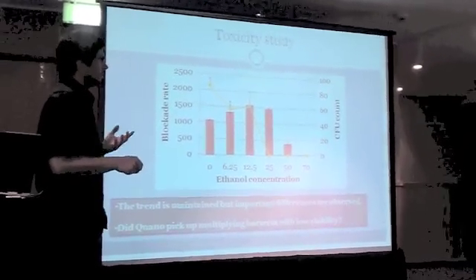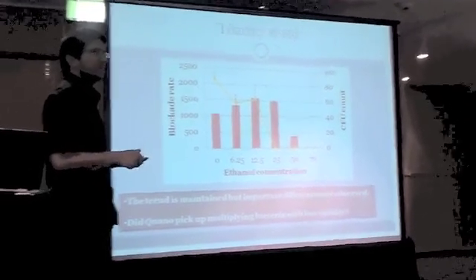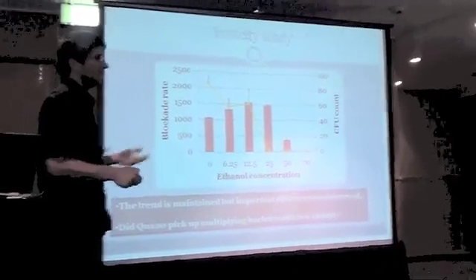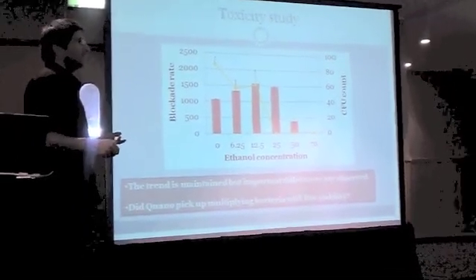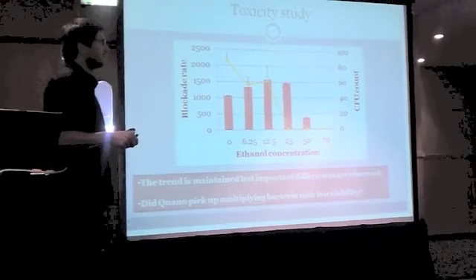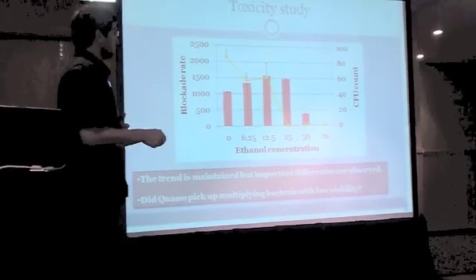So this has interesting implications, because it's not because the bacteria has a lower vitality that it's less toxic. If you take, for instance, something basic like E. coli, one of the main toxins is LPS, the lipopolysaccharide. It's not because the bacteria has low vitality that it's not toxic. So it's still interesting to see these bacteria, and that's making quite a strong case for the qNano.